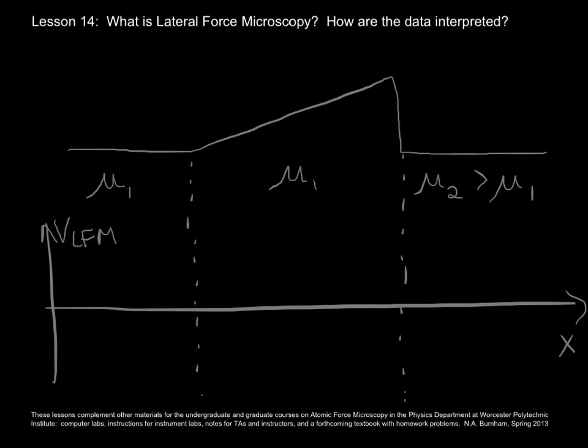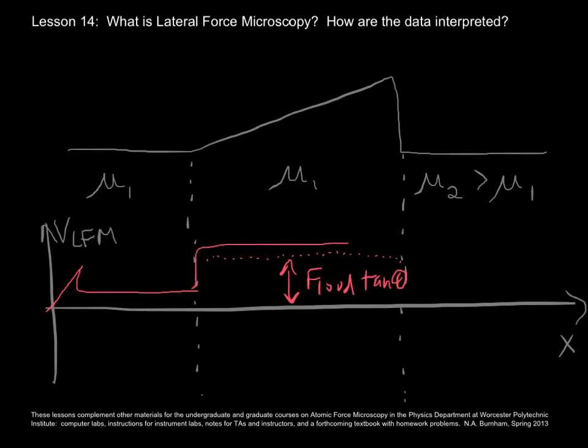So we start off perhaps with a static friction event, and then we start sliding. Then as we come up to the slope, we realize the average value of the friction is now the load times the tangent of the angle, and then the deviation from that average value is by mu times the load.